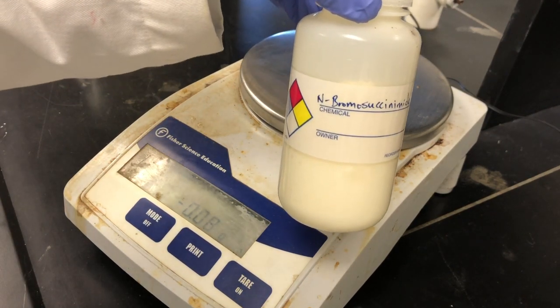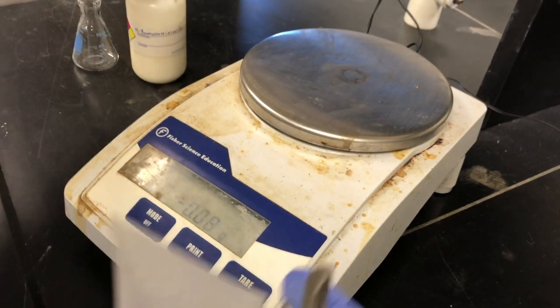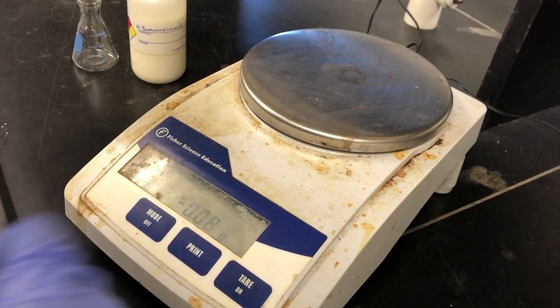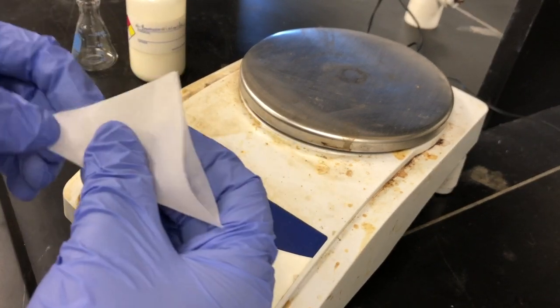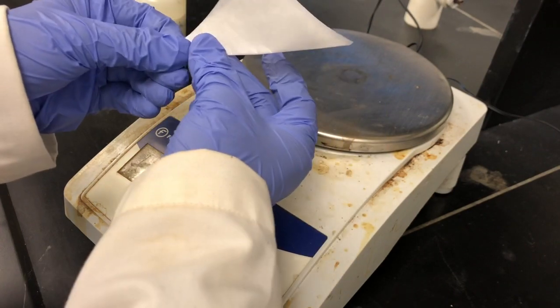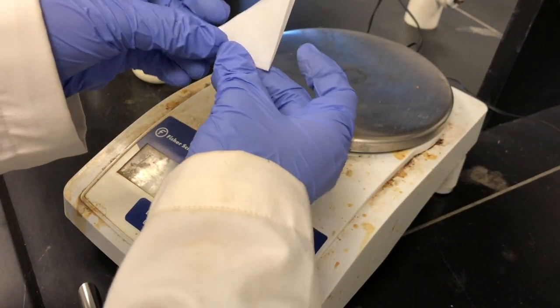We're going to weigh out right around one gram of N-bromosuccinimide. Remember, it's just right around one gram. So whatever we end up recording or measuring out, we'll record the exact mass. We're going to use a weighing paper to make this transfer a little easier later.